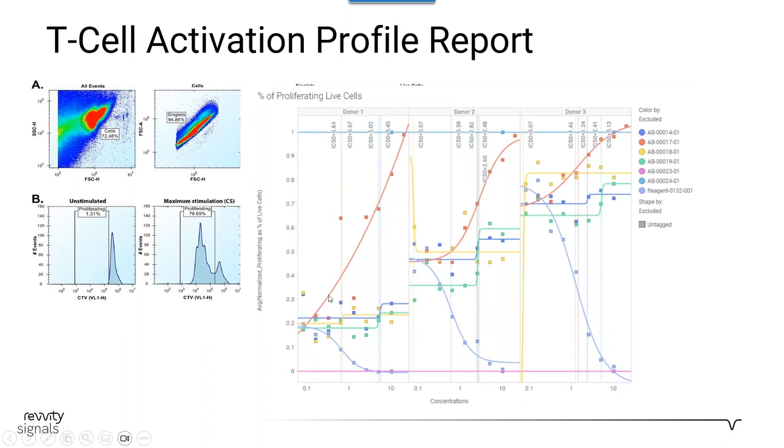But if we were looking at an immune response or suppression, we want to decrease the activation of T cells because we don't want an immune response. And the last bit could just be maybe whether these are controls or maybe we're looking for drugs that do neither from a safety or efficacy standpoint, so no change in activation. But this assay can basically help us in the drug discovery process, especially for the various different disease areas that we're going after. So this is where we're going to end.